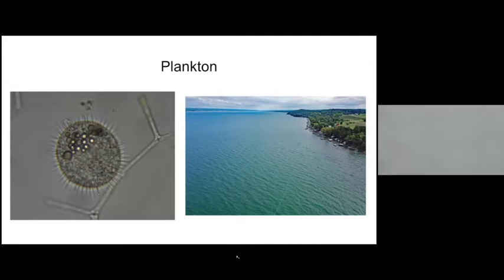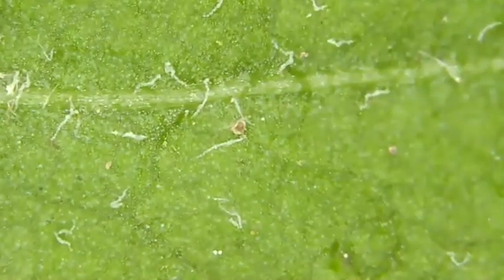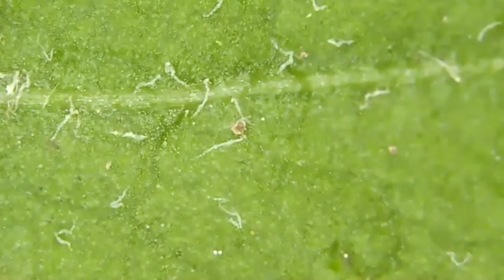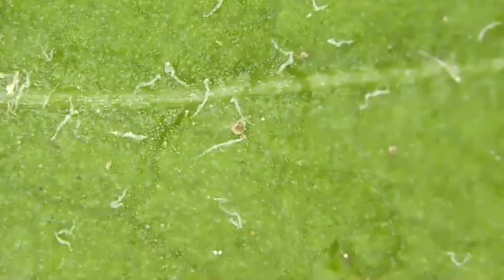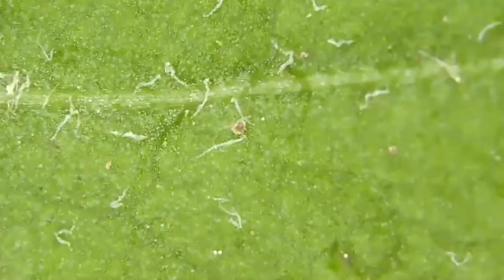Okay, so if you want to pull up the microscope again, you could see this closer up. All right, what are some observations? I think it's a leaf. A leaf? Why do you say that? Because it's green. It's green, yeah. So these next two images we're going to look at under the microscope are from plants. So yes, you're right. It is a leaf. That was a really good guess.